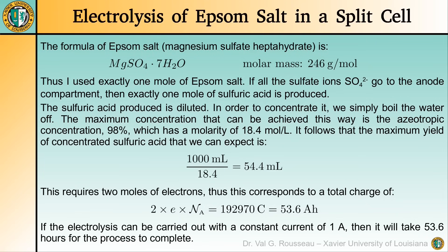We will obtain dilute sulfuric acid that we can concentrate up to 98% simply by boiling the water off. Such concentrated sulfuric acid is known to have a molarity of 18.4 moles per liter. Since we have one mole of acid, this corresponds to a volume of 54.4 milliliters of concentrated sulfuric acid. Once again, this is an upper limit — we will obtain much less, but hopefully a few milliliters.